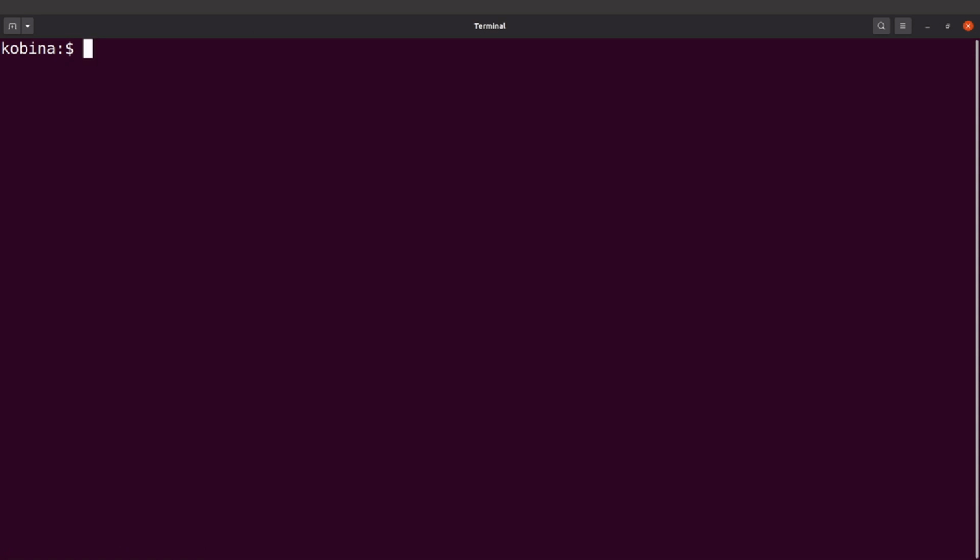Okay, we are on the terminal now. So what we will do first is to create a working directory. So we will say mkdir RNA-Seq, and then we are going to cd into it. And so this means that the files that we will generate will all be saved in this directory. And it's important we do this because we would like to separate all the files that we are going to generate from files that are already on our PC. Okay, so now we have created it, we have cd'd into it. So what we are going to do next is to download the necessary files.